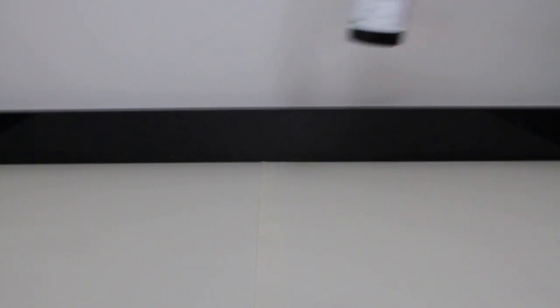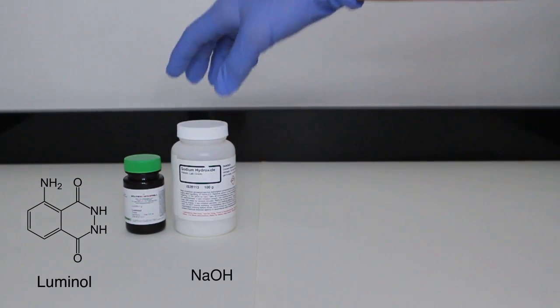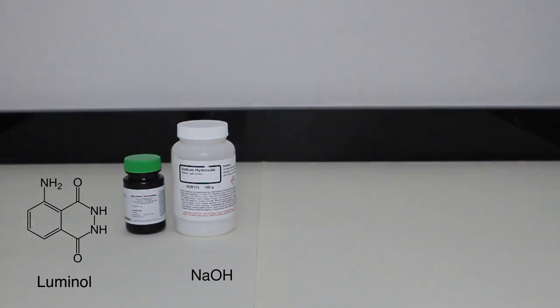This goes pretty well, so stick to the end of the video to see this. To get started, I prepared my workstation and gathered the required chemicals. In the reaction's most basic form, all we need is the luminol, a base — in this case sodium hydroxide — and an oxidizing solution, in this case household bleach.